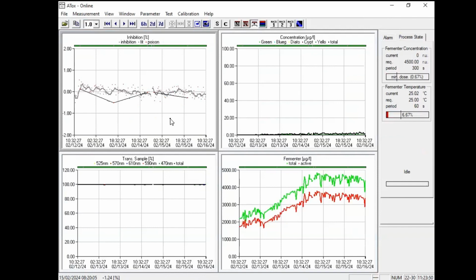What about the distilled water or deionized water? Also, it will kill the algae, yeah? But not so fast. It's not perfect. You put them into osmotic stress, but I know places which were operating AlgaeToximeter and they use Milli-Q water.